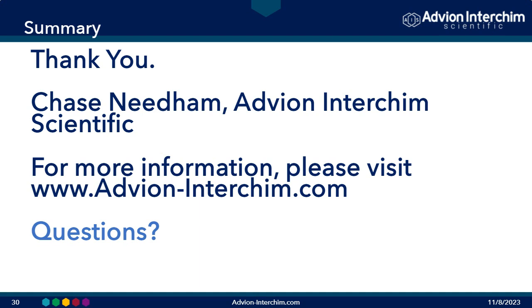Great, thank you. I have another question for you here. This one asks, how do I choose my column size for a purification? Oh, good question. So column size is always going to be determined by a couple of factors. The number one factor is going to be the amount of crude material you have. Obviously, more crude material means you need more silica to purify it.